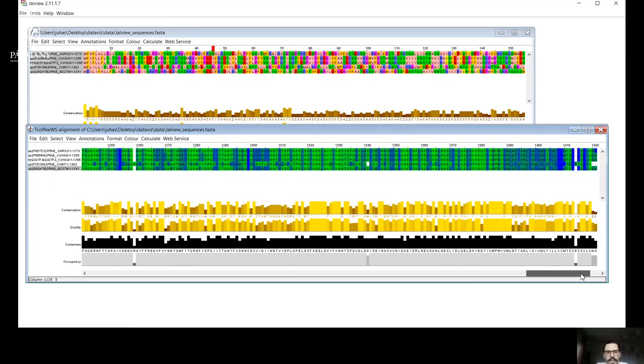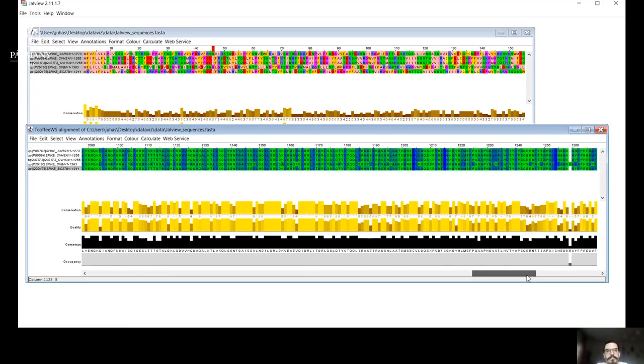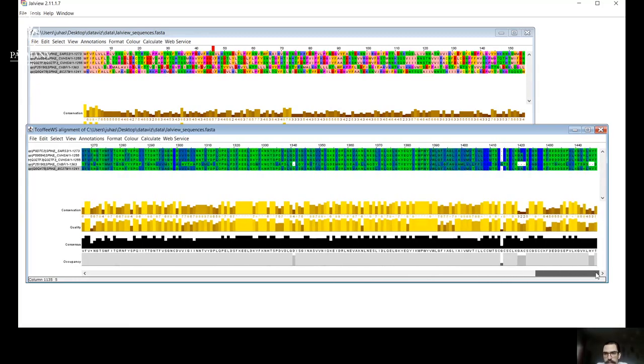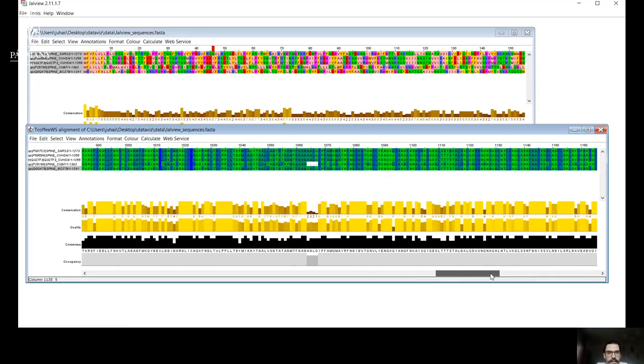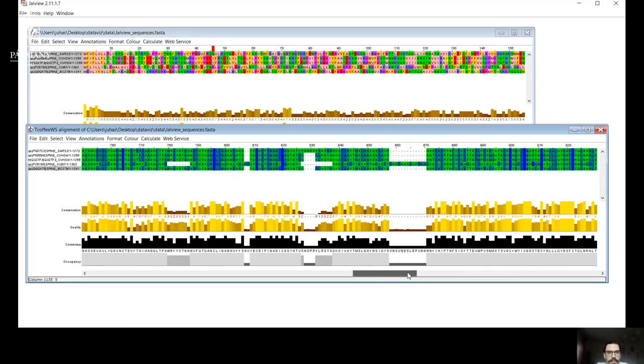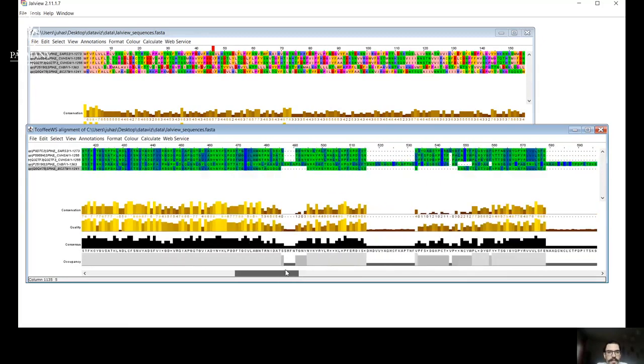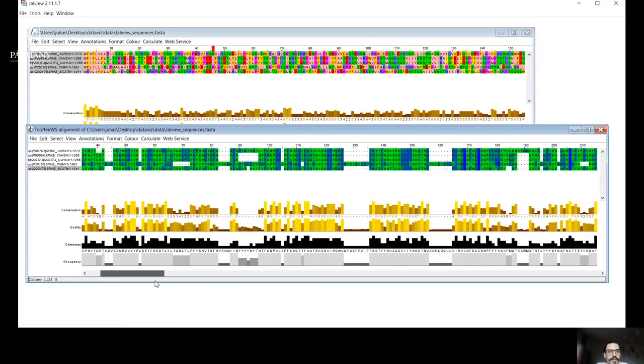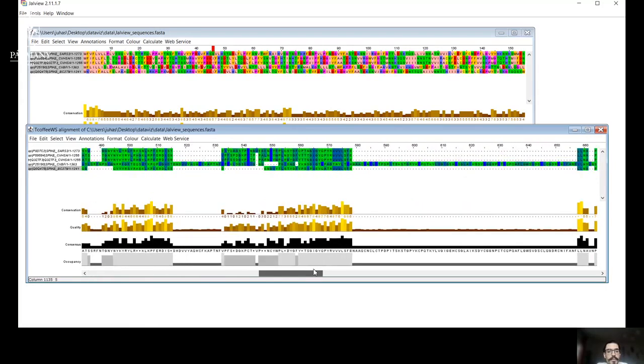And this buried index corresponds to the 3D structure of the protein. And here, based on these buried indexes, there is pretty nice consensus between the sequences. It could mean that their 3-dimensional structures could be related.